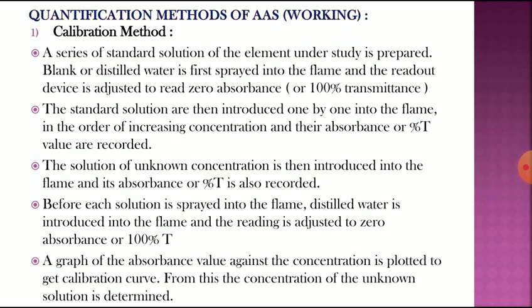As we have seen in flame emission spectroscopy, the calibration method, standard addition method, and internal standard method are the same as those of FES. In AAS also we can see these three methods.